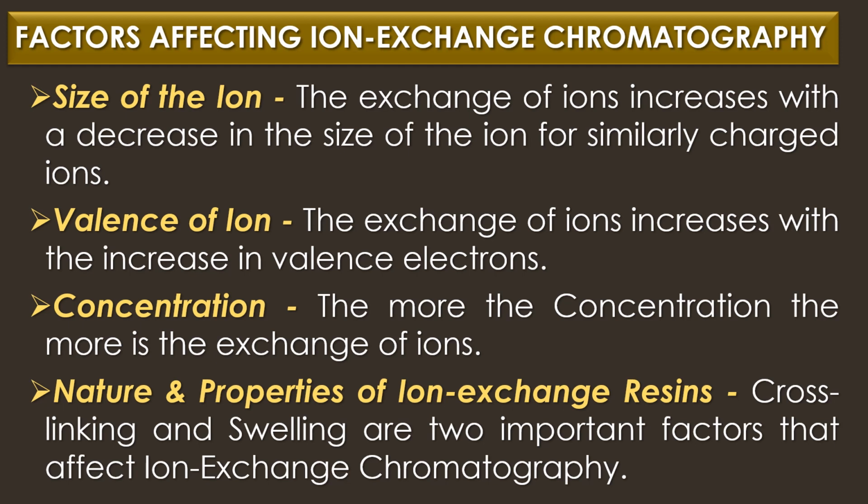Cross-linking and swelling are two important factors that affect the ion exchange chromatography. When there is more cross-linking, then it swells less. So, it has less pore size, making it difficult to exchange ions of larger size molecules.